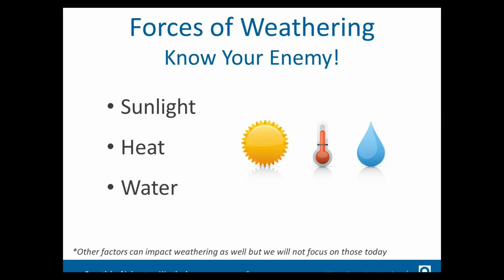There are some other factors that impact natural weathering in particular, such as pollution or bacterial growth, but we're not going to really cover those today because we're going to focus on the key three features that are used in laboratory weathering, which are sunlight, heat, and moisture.